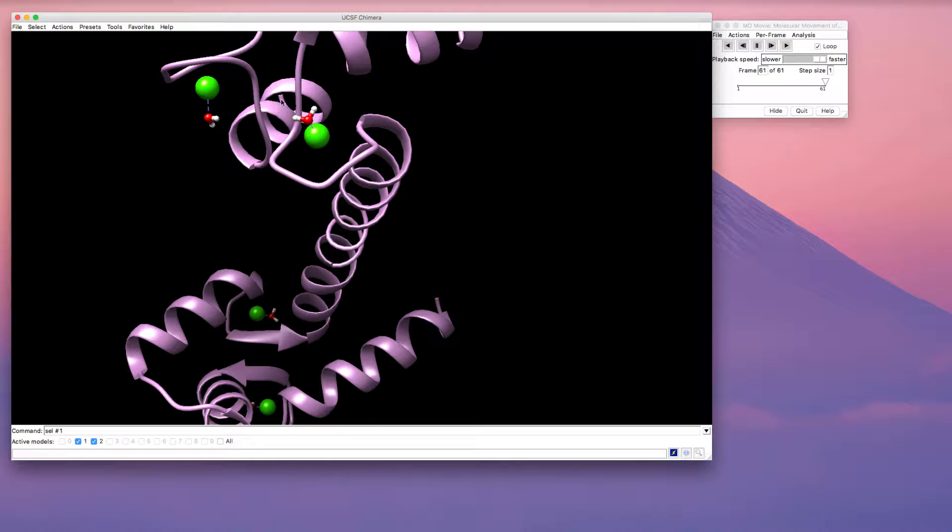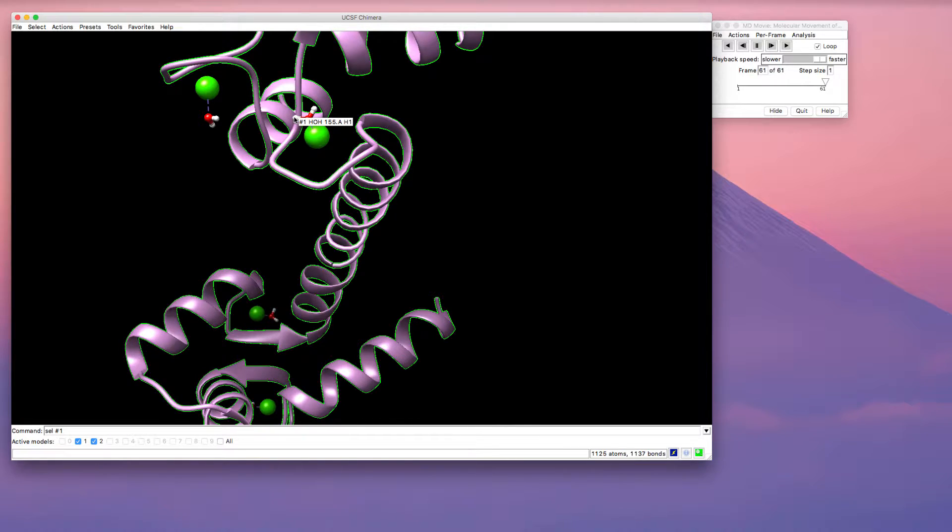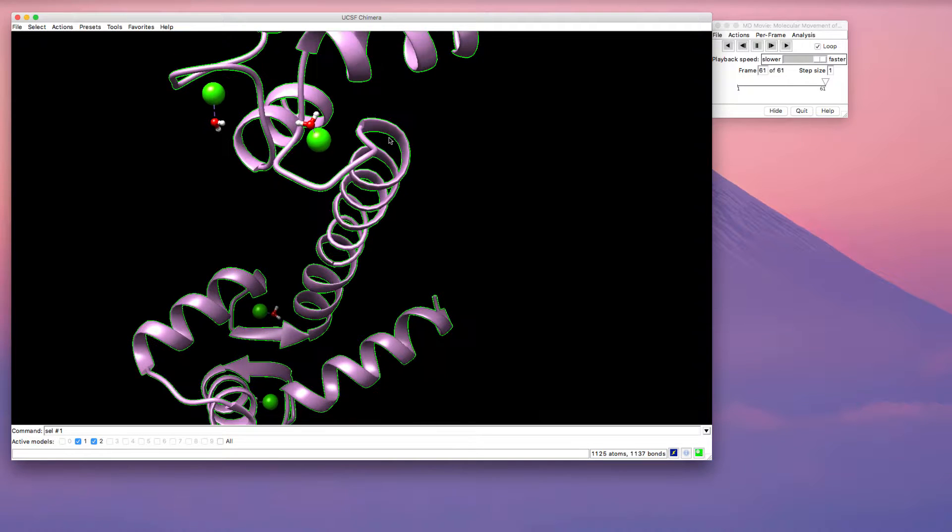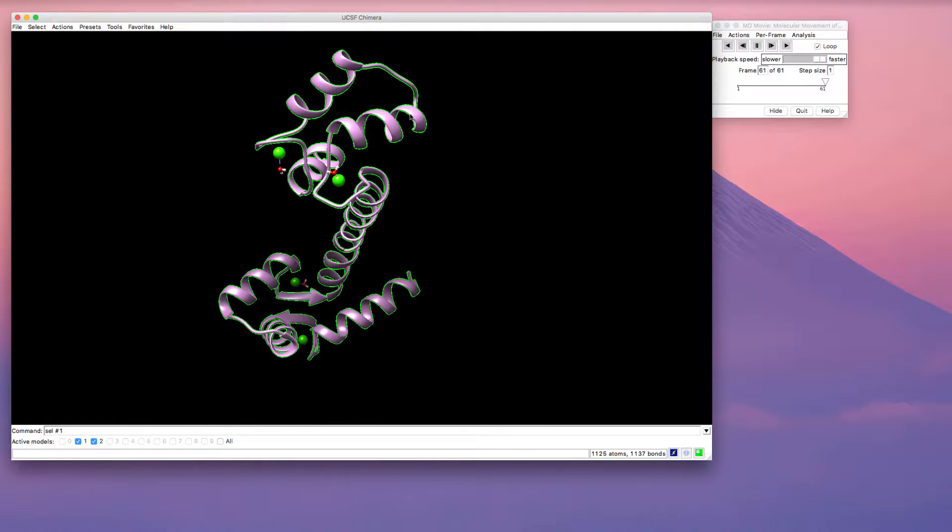I'd also like to change the color of this ribbon. One of the ways you can select the ribbon is by hovering over it, press control and click. So that selects one area on the ribbon. Use the up arrow key, it expands that selection. So now I've selected this entire protein and I'd like to change its colors.